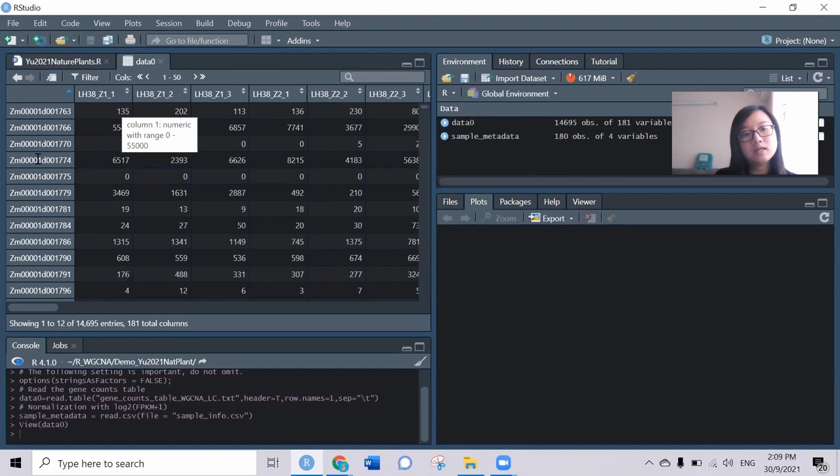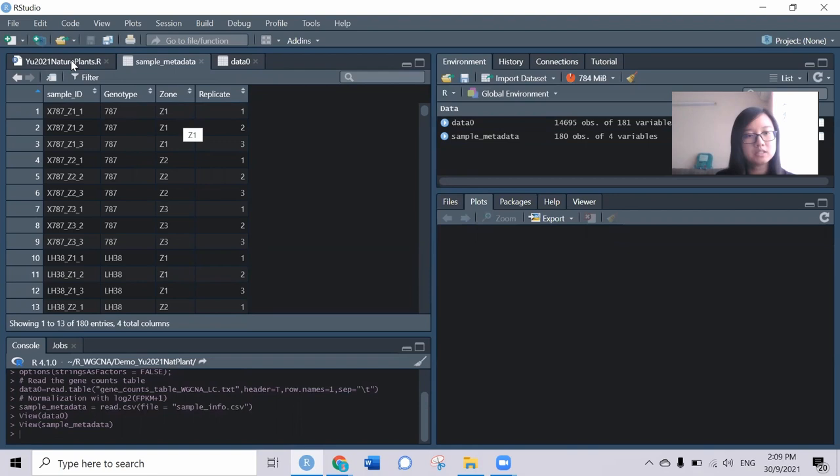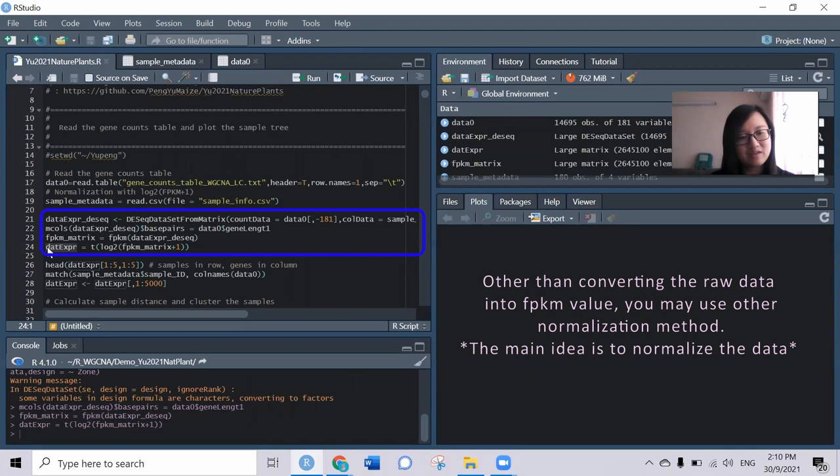The columns are all the sample IDs and the rows are the genes. The last column here is the gene length for each of the genes. For the sample metadata, they have several phenotype information for the samples, a total of 180 samples. The first thing is to get the FPKM value.